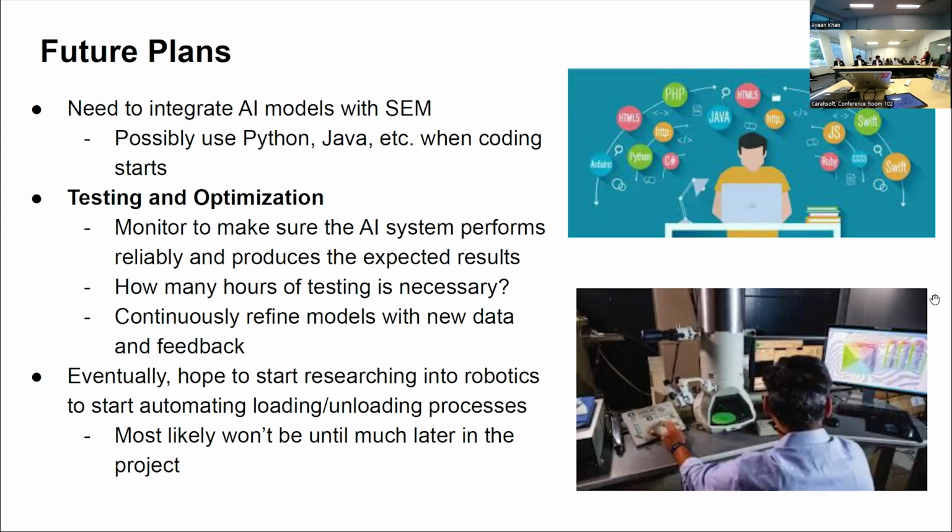Yeah, very good research. I see you using XGBoost, which is a decision tree method, not a neural network. Are you looking at also potentially using a transformer model or some generative architecture, deep learning, to do the image processing? Yes, that'll be sometime in the future. It's a new project we just started, so this is just the basics of what we covered. Right. Sometimes even traditional ML methods still work. Right. Thanks.